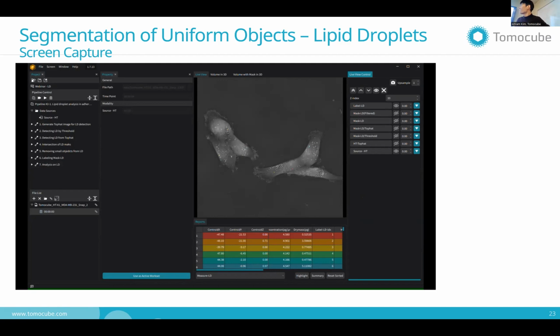But very interestingly, those nucleoli, the absolute RI value does not coincide with the criteria, so we can exclude them with the other criteria. Okay. Yeah. So that's the reason why we combine the two criteria.